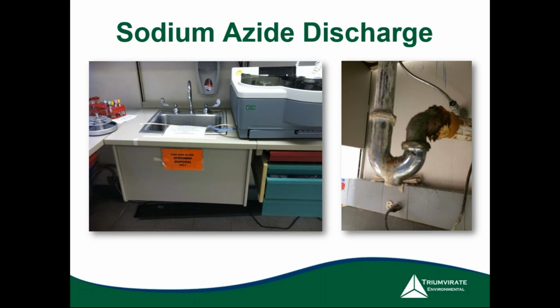That's when the metal azide reacted, and it blew up in his hand, caused shrapnel to enter his hand, and caused ear damage and psychological trauma, just from quite a surprise to pick up that piece of pipe and have it blow up in your hand unexpectedly. So it was a big deal. I talked with the guy after, when we had gone up to do our remediation, and he was back to work. Luckily, he had healed, but had multiple surgeries. This is definitely a hazard, and it affects plumbers and maintenance people who maybe aren't aware of everything that's going on in a lab, especially discharge like this of sodium azide when there is that potential.